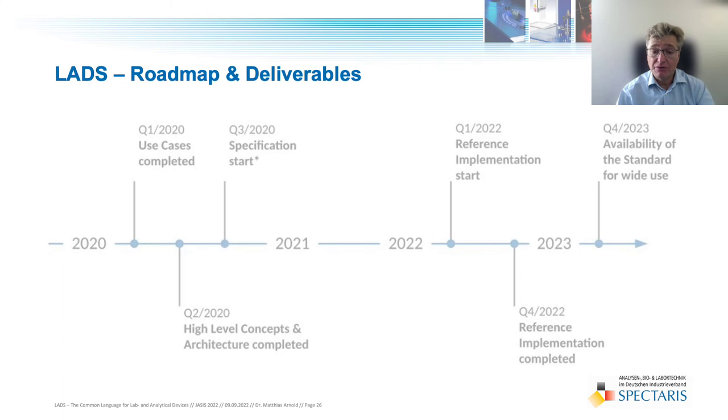Now that I have introduced you to LADS OPC UA and its two main principles that enable horizontal, broad and vertical, deep integration of laboratory and analytical devices, let us turn our attention to the question: where are we today with LADS, and what are our deliverables? Let's look at the LADS roadmap.